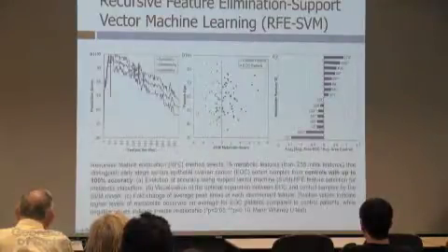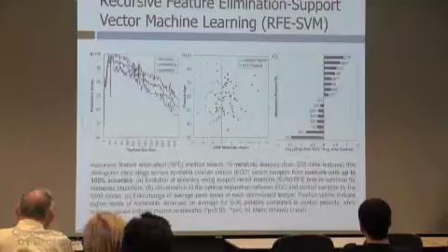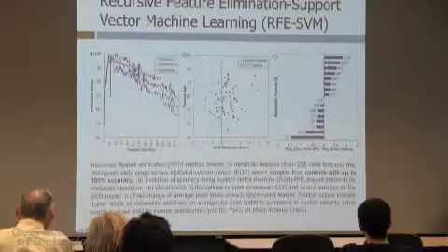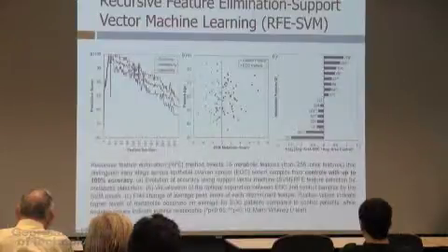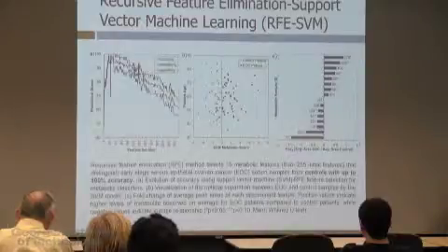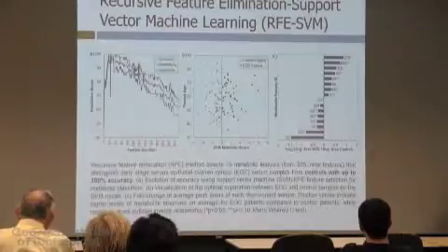But then if you use a feature selection mechanism like a genetic algorithm, in this case we use a more sophisticated approach. We use something called recursive feature elimination support vector machines. These are actually much more sophisticated because in human data the variability is much more complex to model. And you let it select, there's an optimum number of features around 15 right there where you can discriminate very well. So if you take these subsets here, you see you can discriminate between control patients and early stage cancer in human samples. Okay, so this is what we want to do.